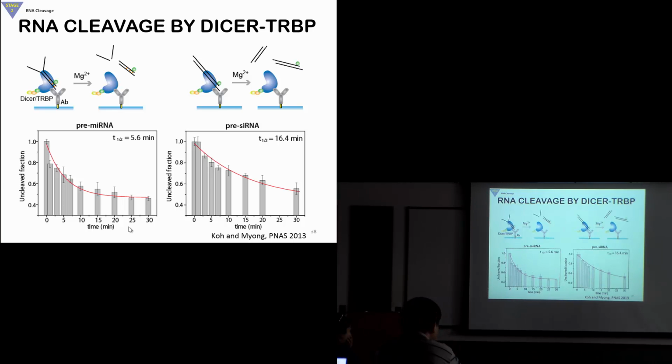So we seed our DNA at a very low concentration, typically picomolar range. So this is 10 to the minus 12. That's very crucial, so we cannot go very high. We seed it so that they will be well separated from each other. You've seen the image, and the width of that image is about 25 microns. Across the 25 microns, you don't see very many molecules, I would say a maximum of 20. So that density is crucial. Thank you for the question.